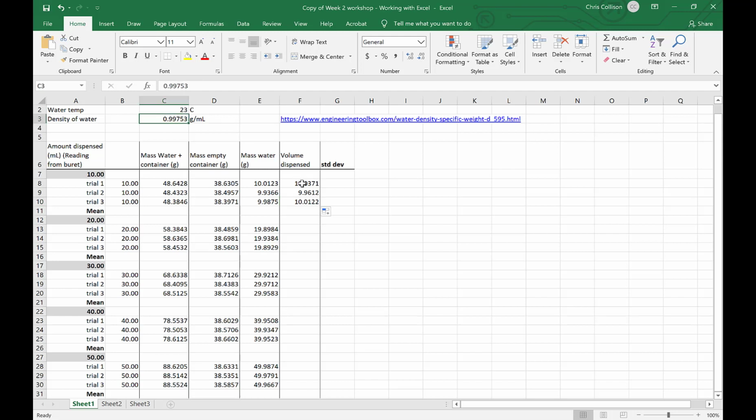Another thing we can do is copy. I'm going to press Control C, my shortcut key for copy. I'm going to press Control V, which allows me to paste into this cell. And what happens now is I'm pasting the formula with C3 locked as my locked cell. So that remains in the denominator. I can again use the drag down function and drag through these cells.